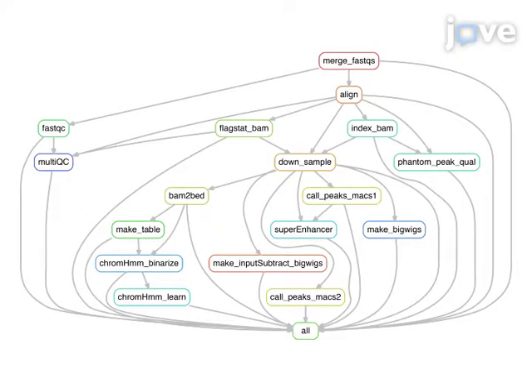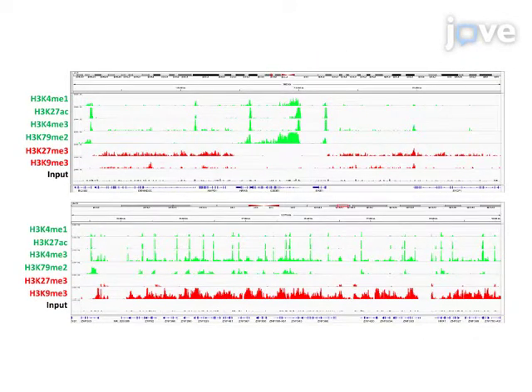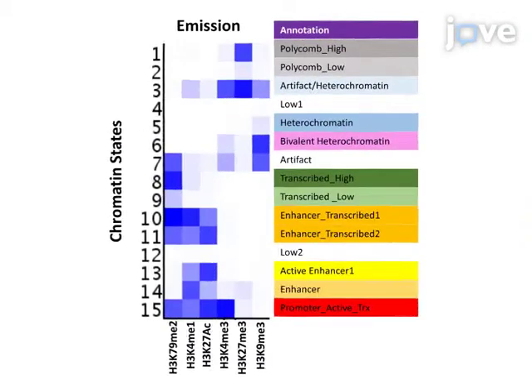Upon post-sequencing, there are many quality control metrics that should be met before proceeding to further steps of the pipeline, such as MACS peak calling or ChromHMM analysis. ChIP samples should be enriched over input DNA, and each histone modification should display a distinct profile representing a specific component of the epigenetic landscape. The ChromHMM algorithm uses a multivariate hidden Markov model to identify the most prominent recurring combinatorial and spatial chromatin patterns based on the histone modifications studied.